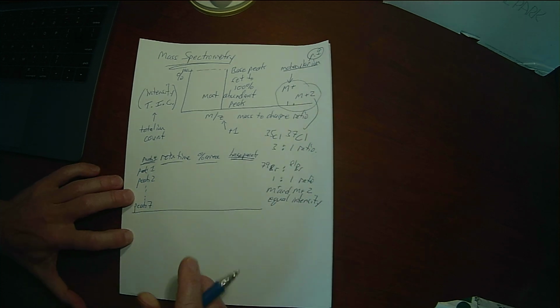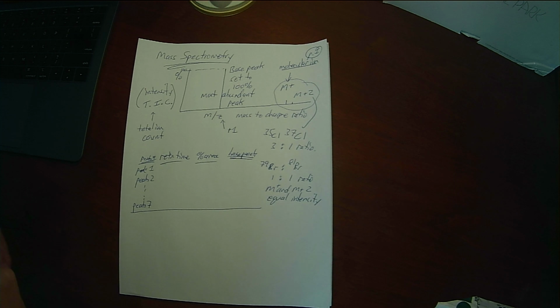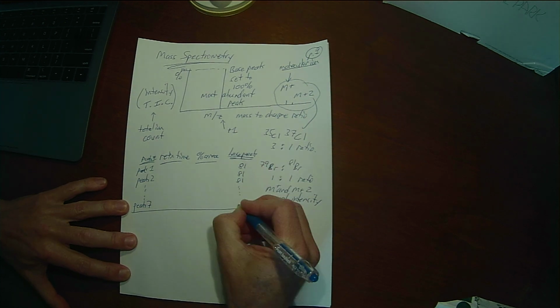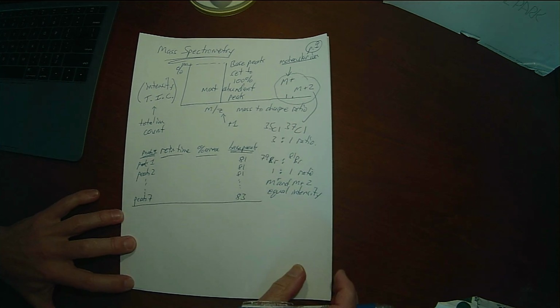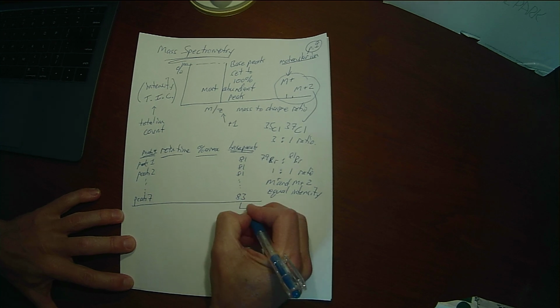So this base peak, I think you noticed, what's the base peak on pretty much all of them except for 1? Have you had a chance to look at the data yet? 81. It's 81 for all of them except for? The 83 on the 7th peak. On the 7th peak is 83, right? So it's almost always 81, but we didn't tell you anything about where that 81 peak came from, right? Why is 81 the abundant peak? We did tell you what to look for, right, this 83 peak, right?